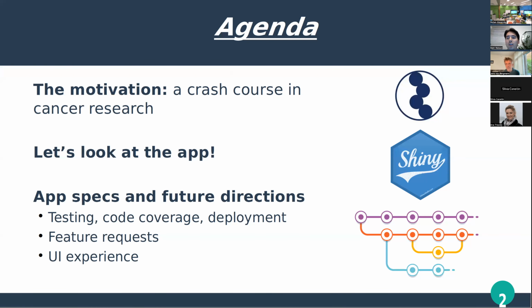I'll show some pre-curated data and show some of the features and some of the statistical inference that can be achieved with the application. And finally, I'll end with some of the app specs, a bit of the under the hood stuff, discussing the development process, as well as where we're hoping to take the application development in the coming months. So just a little bit of overview, some overarching principles of the cancer research space.